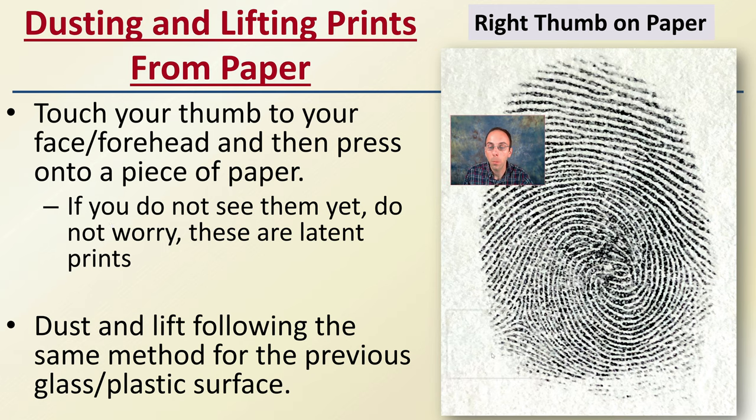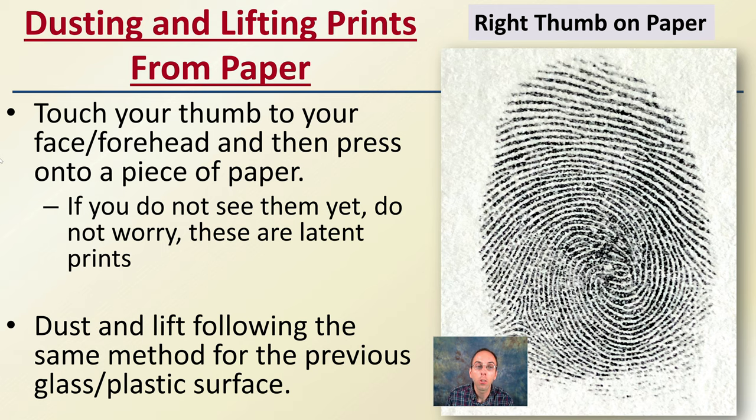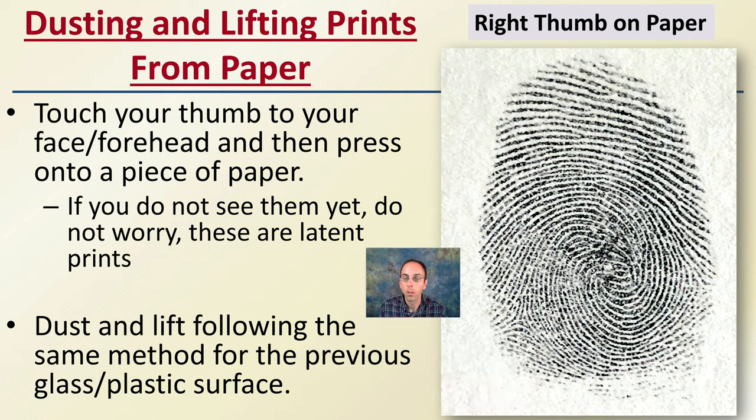Now, dusting for fingerprints if you're on paper. Touch your thumb to your forehead and press it on a piece of paper. If you don't see the print, don't worry — these are latent prints. A lot of students will make the print on the paper and then try to look for it; a lot of times they won't be able to see it, and that's okay. Dust and lift following the same method as the previous example. The same procedure for glass and plastic applies to paper. If you do it correctly, you can get a print that looks very much like this, which allows you to identify the type of print and see specific classifications to determine if you have a match between two prints.